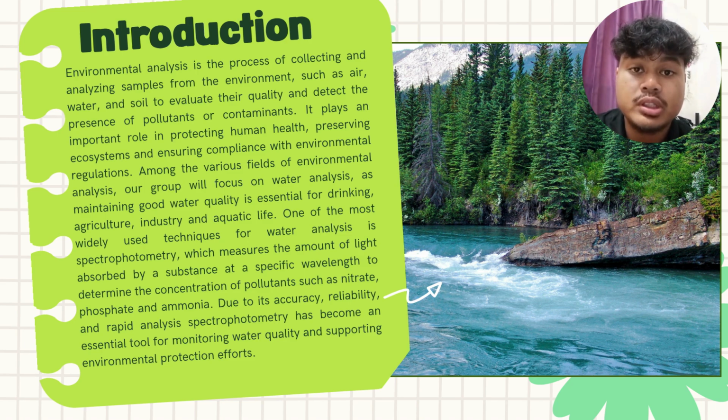For the first part, we have introduction. Environmental analysis is the process of collecting and analyzing samples from the environment, such as air, water, and soil, to evaluate their quality and detect the presence of pollutants or contaminants. It plays an important role in protecting human health, preserving ecosystems, and ensuring compliance with environmental regulations.